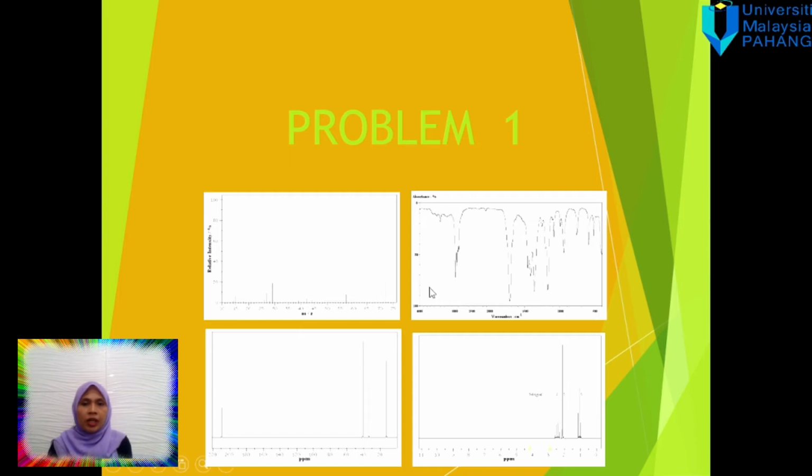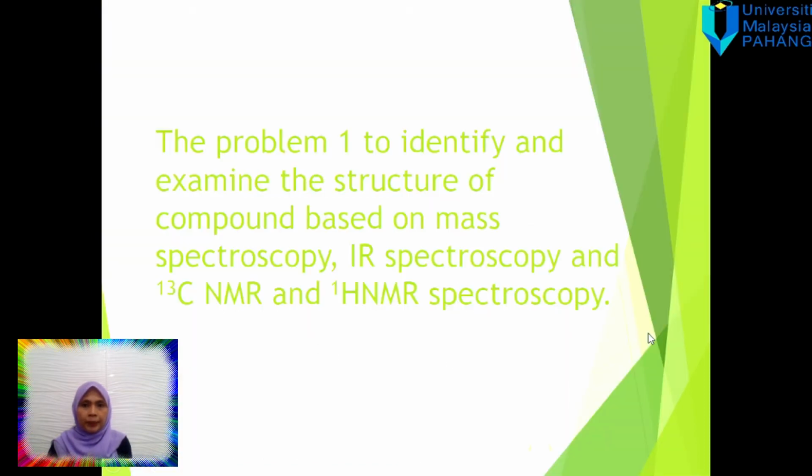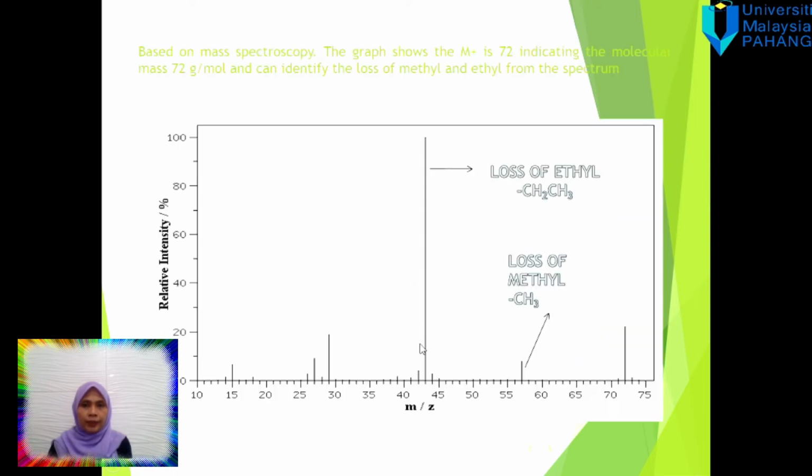Problem 1 is to examine the structure of the compound based on mass spectroscopy, IR spectroscopy, C13 NMR, and 1H NMR spectroscopy.